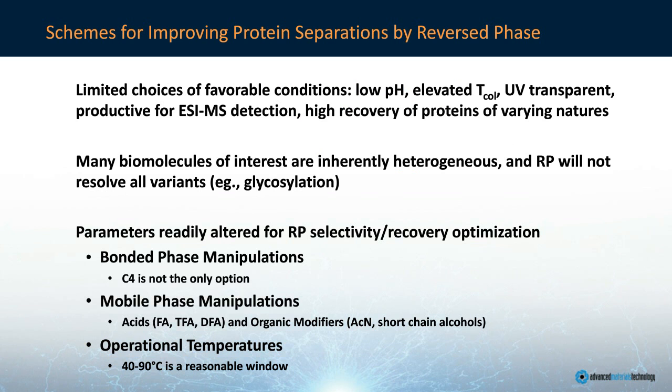So we've talked about some ways in which the particle structure can be adjusted to change the effects on performance for your particular protein of interest. Another way to improve your separation is to manipulate the mobile phase, your bonded phase, and your operational temperatures.